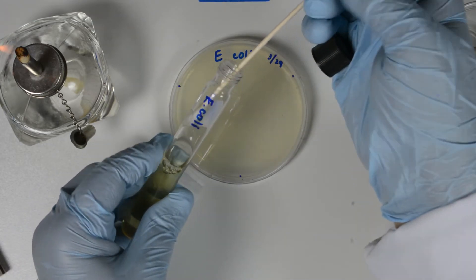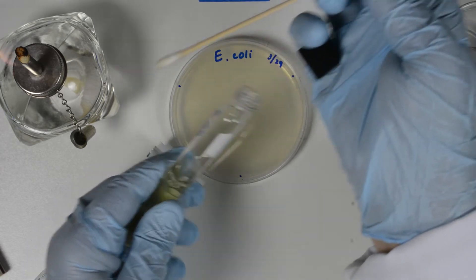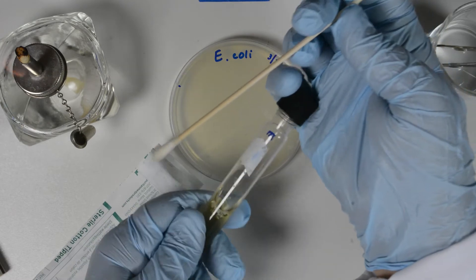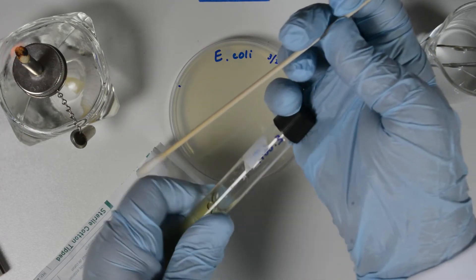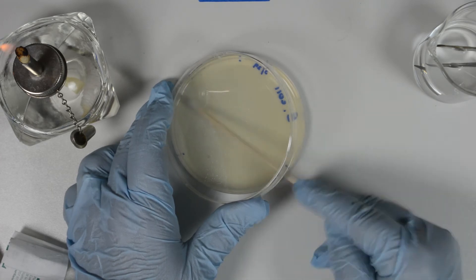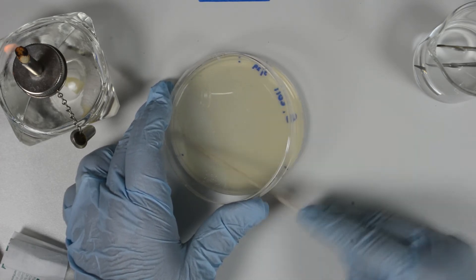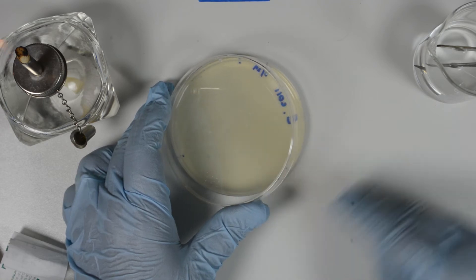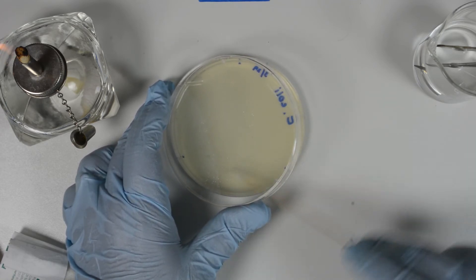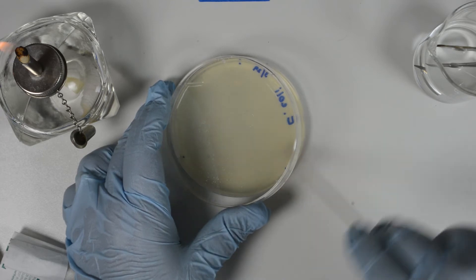Take the sterile cotton swab with the hand holding the cap. Insert the cotton swab into the broth. Press the swab against the glass inside the tube to remove excess liquid. Lift the lid of the plate only enough to be able to insert the cotton swab — do not take that lid off. Take the swab and cover the surface of the agar evenly by moving in both directions, making a tight zigzag.